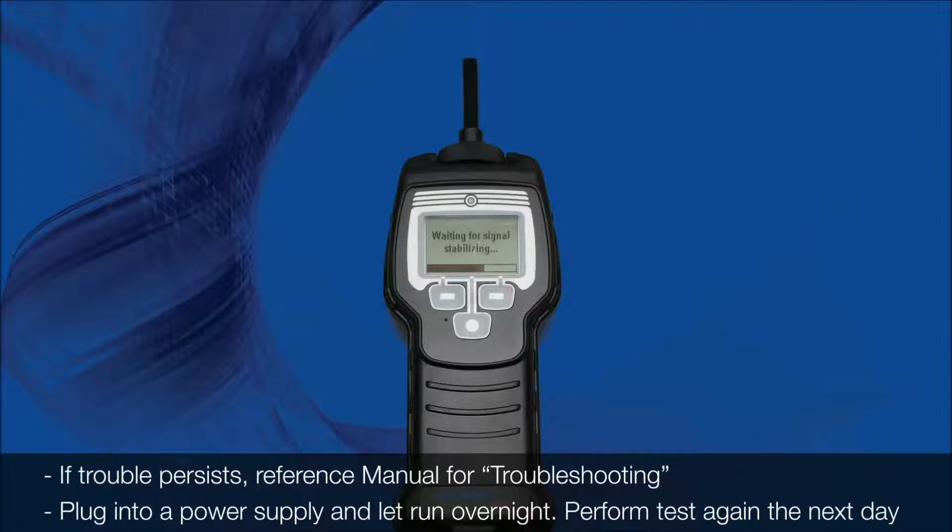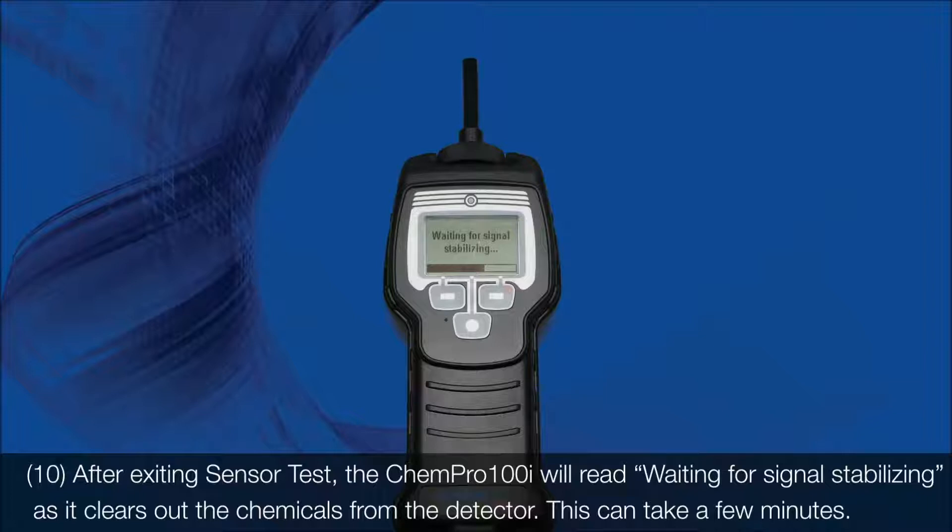Perform the test again the next day. 10. After exiting sensor test, the Kempro 100i will read, waiting for signal stabilizing, as it clears out the chemicals from the detector. This can take a few minutes.